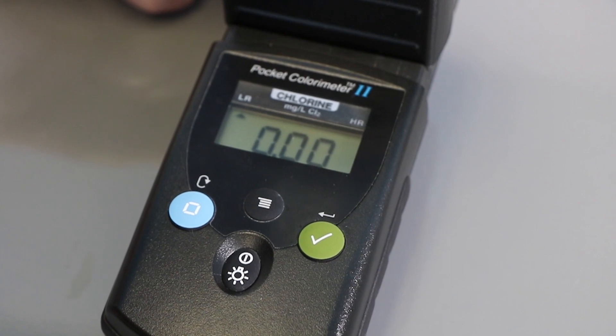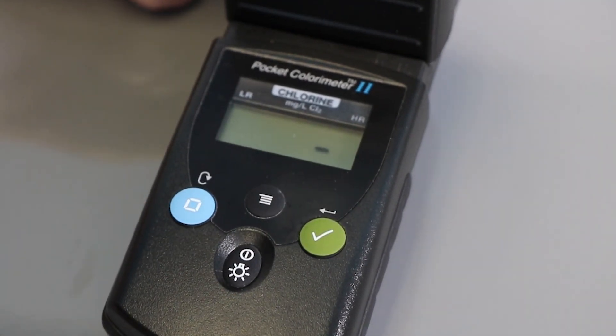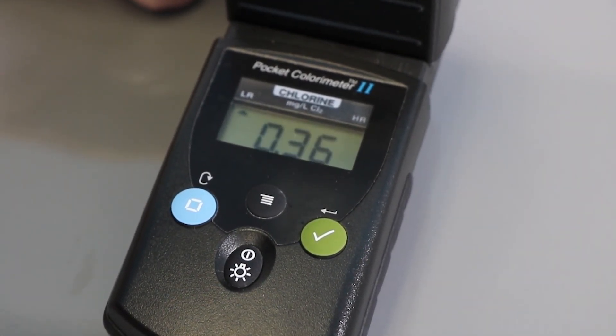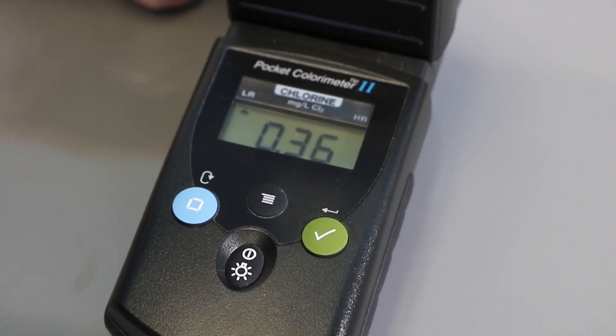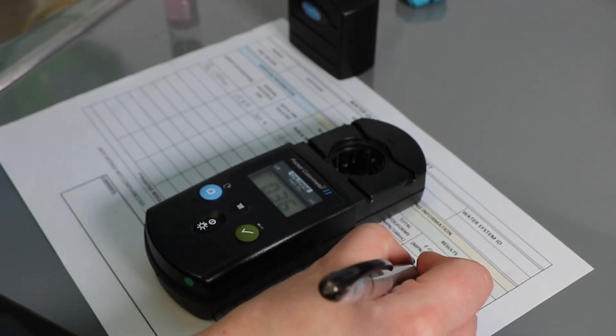With the chlorometer on a flat surface, press the checkmark symbol button. For free chlorine, this needs to be done within one minute of adding the DPD to the sample water. Record the number on your field sample data sheet.